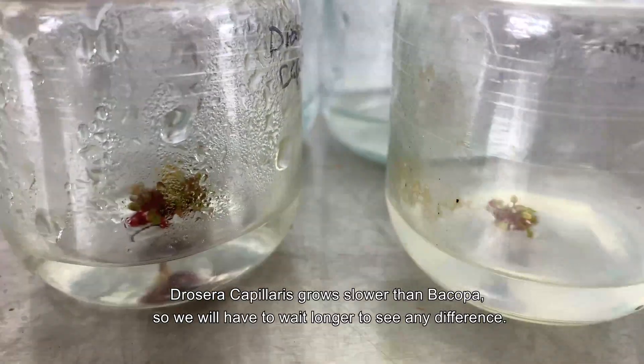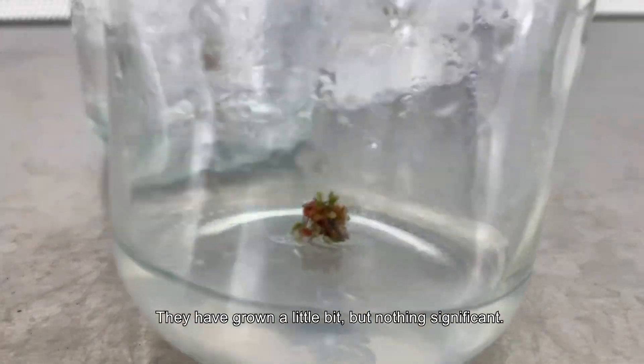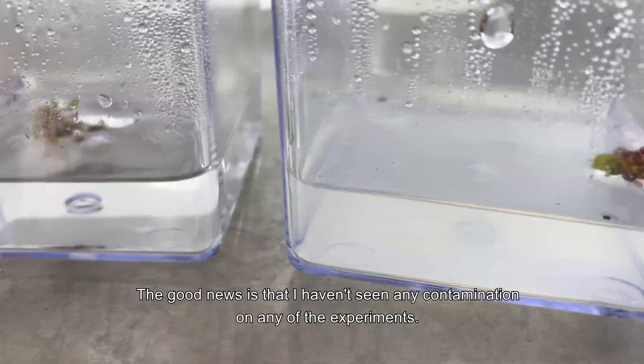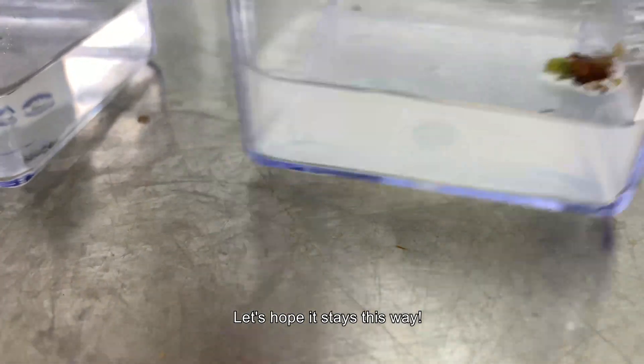Drosera capillaris grows slower than bacopa, so we will have to wait a bit longer to see any difference. They have grown a little bit but nothing significant. The good news is that I haven't seen any contamination on any of the experiments — let's hope it stays that way.